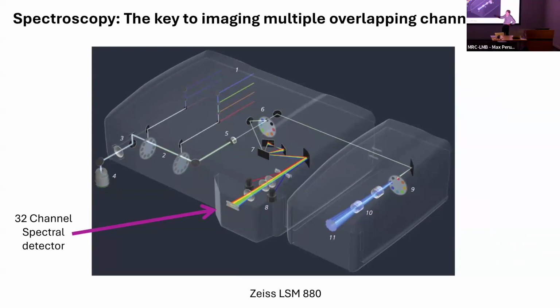The light from there can basically go into a spectrometer, be spread out in the spectrum, and we can do multi-channel imaging off those. And that leads us into this ability to unmix multiple dyes. So same sort of problem that Pier was discussing. This bit here is a fancy add-on to try and squeeze out some more resolution, but for the time being, I'll just stick to the spectroscopy.